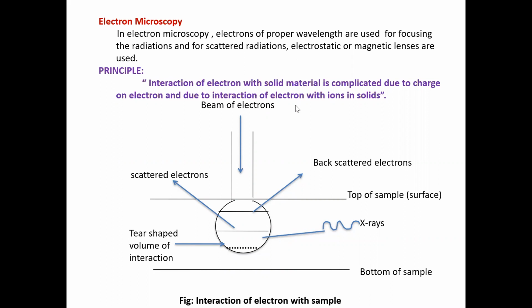Now we will understand scanning electron microscopy. Before that, in scanning electron microscopy and transmission electron microscopy, electrons are involved, but it is a microscopy.